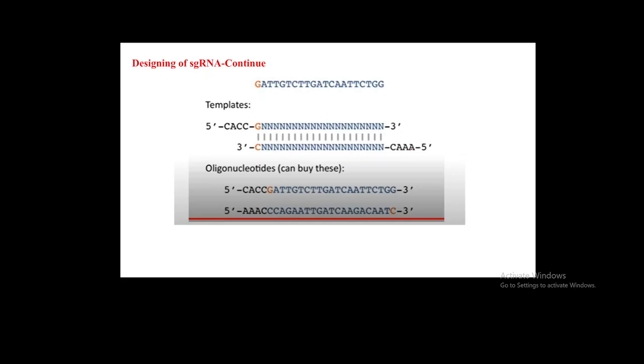And I'm giving lectures currently on the CRISPR. So today we are going to discuss the overall CRISPR protocol. So first of all, you need to design the sgRNA that is against your template strand. And your sgRNA should not contain the PAM sequence. The one thing you need to remember is that it should not contain the PAM sequence.